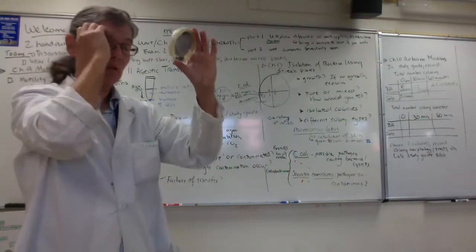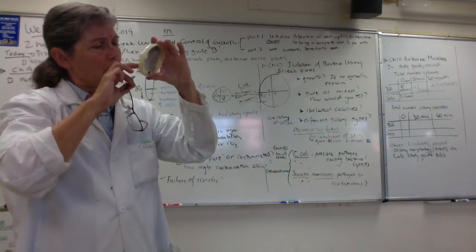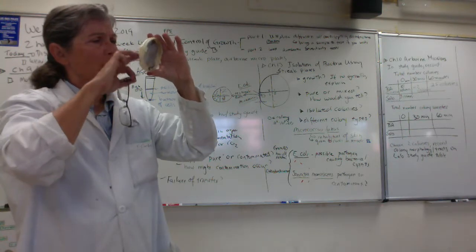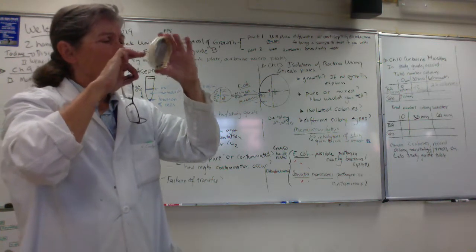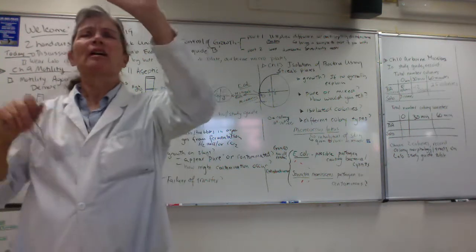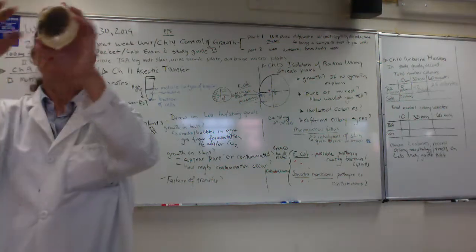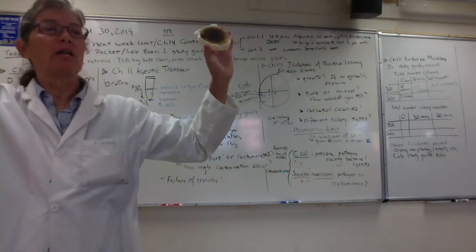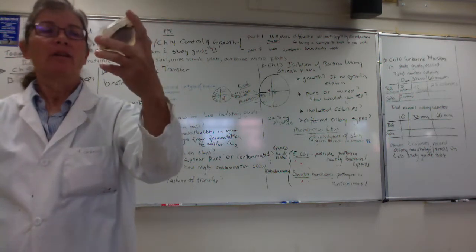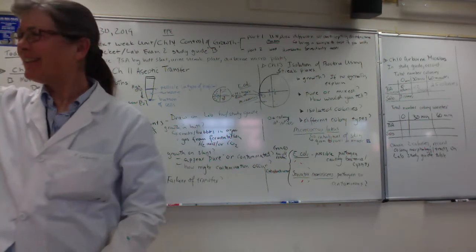So on this plate, it looks to me like 1, 2, 3, 4 have been overgrown. There's a great big guy, 5, 6, 7, 8, 9, 10, 11, 12. So on this SAB plate, it looks to me there are about 12 colonies. And again, count from the bottom, because these big fungal guys will grow over their neighbors, and you won't know there are colonies underneath unless you look from the bottom. Okay? So, are you proud of your immune systems? Just imagine. That's amazing.